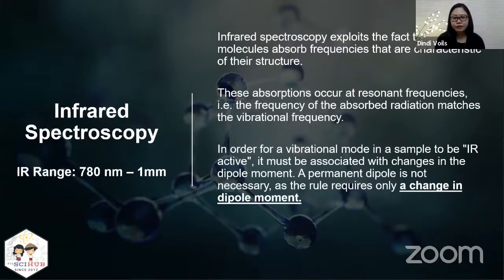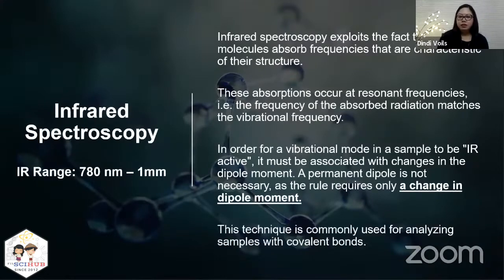A requirement for IR activity is for a vibrational mode to have a change in dipole moment. So a permanent dipole is not always necessary. This technique is commonly used for analyzing samples with covalent bonds.